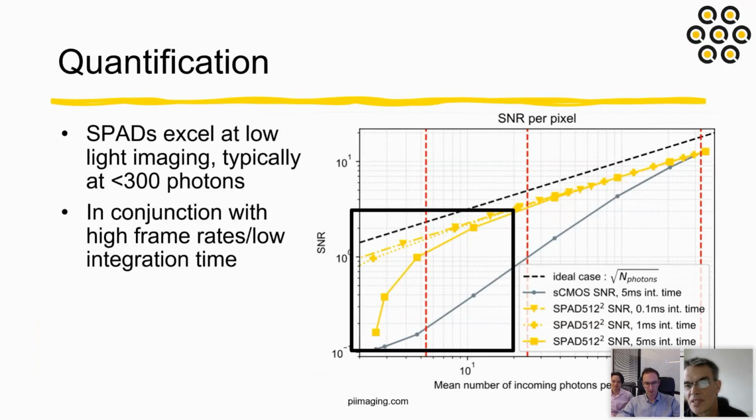Great. And what is the time width of the impulse in tagging mode, and does it vary with count rate? This is 100 picoseconds, and it does not vary with count rate. It does not vary. And in tagging mode, what would you give as a recovery time? The recovery time is limited by the SPAD dead time, so this will be in the range between 10 and 50 nanoseconds, depending on the detector. So for the SPAD lambda it is more 10, and for SPAD 23 it is more 50 nanoseconds.